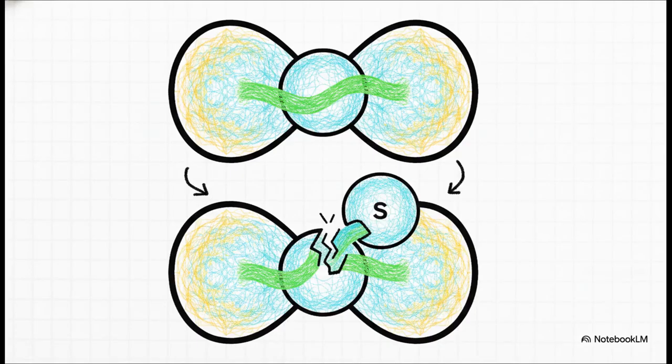Let's actually break down the mechanics of this pi-electron bridge. The orbitals themselves act as literal conduits for the spin information. Because of this, everything depends heavily on the stereochemical 3D geometry of the molecule. For the signal to travel, there absolutely must be a specific spatial overlap between the s orbital of the carbon-hydrogen bond and the pi orbital of the double bond. If the molecule twists into the wrong shape, well, the connection is literally broken, and the protons can no longer hear each other at all.